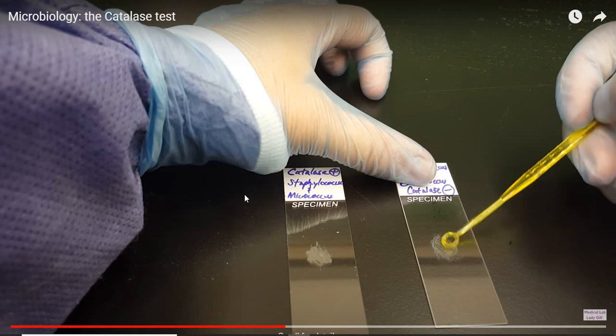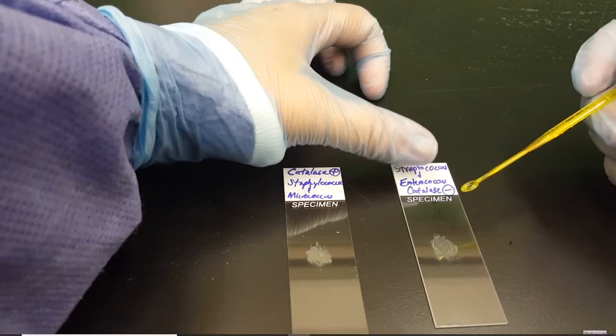Gram-positive cocci, gram-negative cocci, and gram-negative coccobacilli. So Staphylococcus, Micrococcus, Enterococcus, and Streptococcus are all gram-positive cocci. Then we have Neisseria, which is gram-negative cocci, and Moraxella catarrhalis, which is the only gram-negative cocci in Moraxella, and Haemophilus, which is gram-negative coccobacilli. So I put an organism on each, one that should be positive and one that should be negative. I put Staphylococcus aureus on here, and Streptococcus agalactiae on this one.